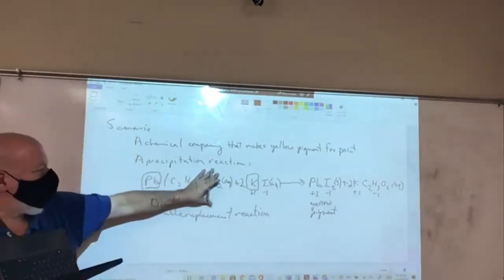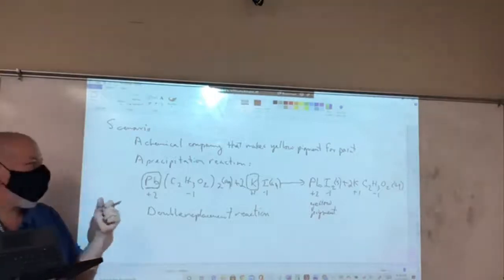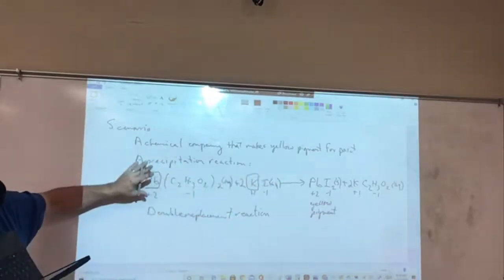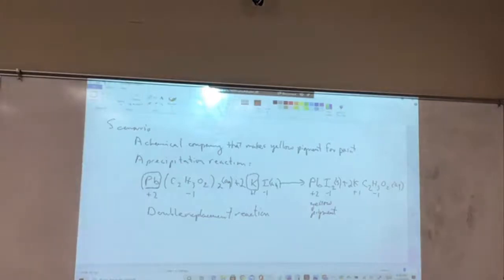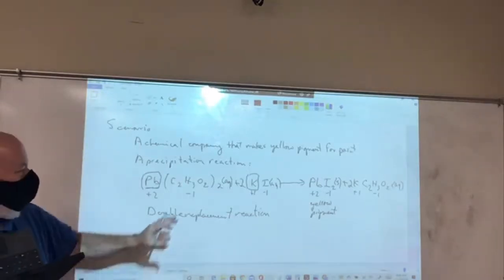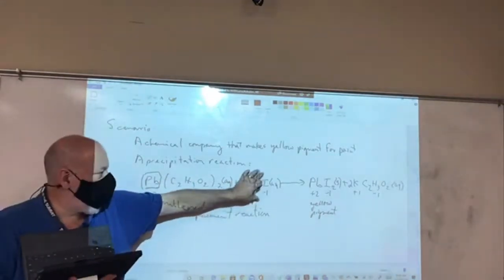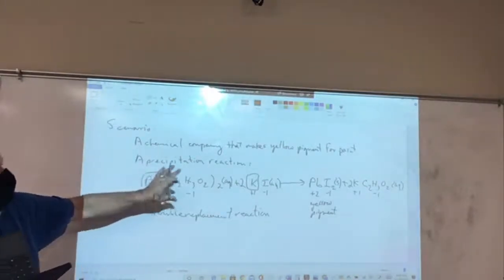Okay? So what I've said then is we need to figure out how am I going to go into the laboratory and make this stuff. We're going to make these two solutions, and you learned two different techniques for making solutions. You learned that we can make a solution by making it in something called a volumetric flask, and you also learned that we can make a solution by using something called a graduated pipette. So we're going to make this solution using the volumetric flask method, and we're going to make this solution using the graduated pipette method.